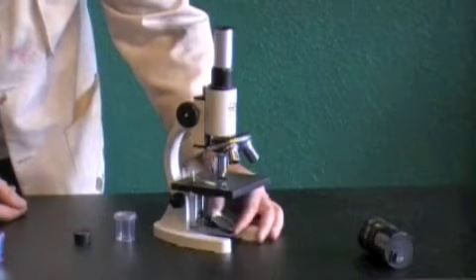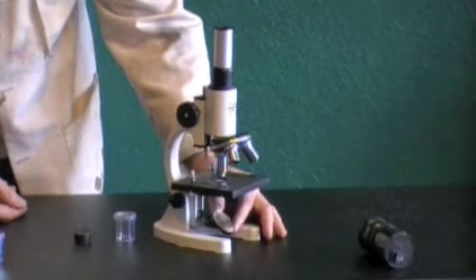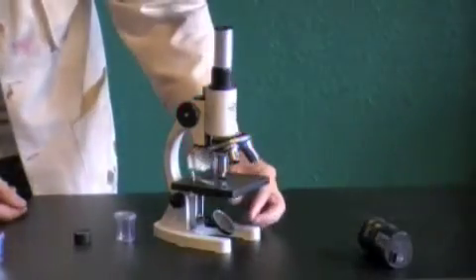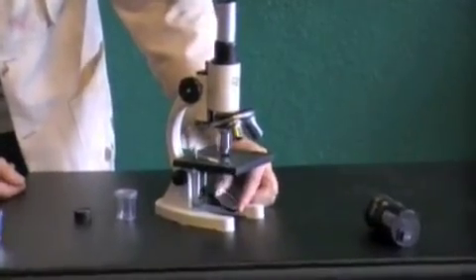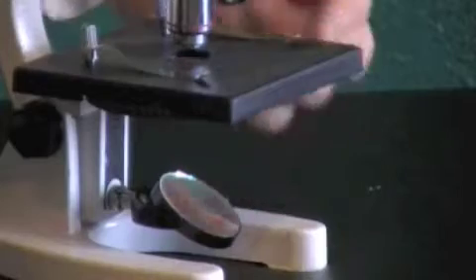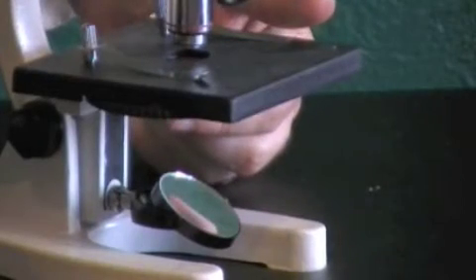To get light through, we're going to have to use this little mirror here. What you do is you have a light source, a lamp or the sunlight or something that you can reflect the light up through the hole in the stage through your specimen so you can see it.